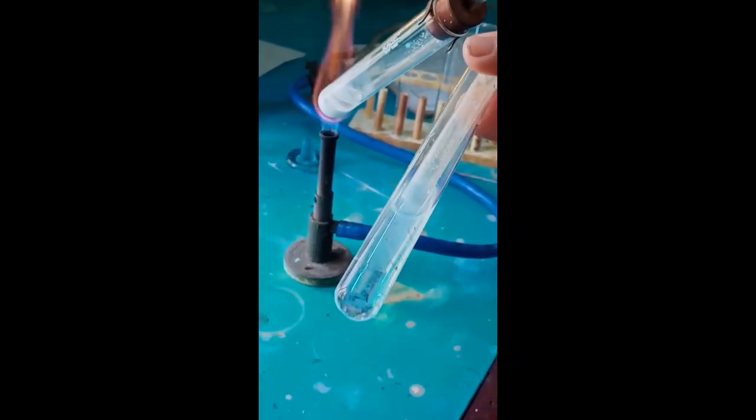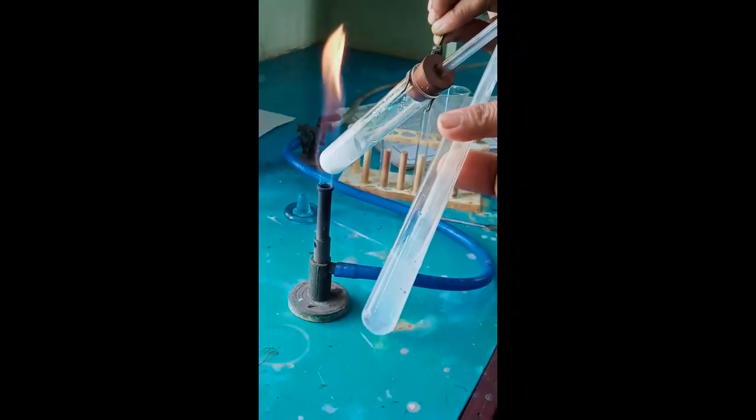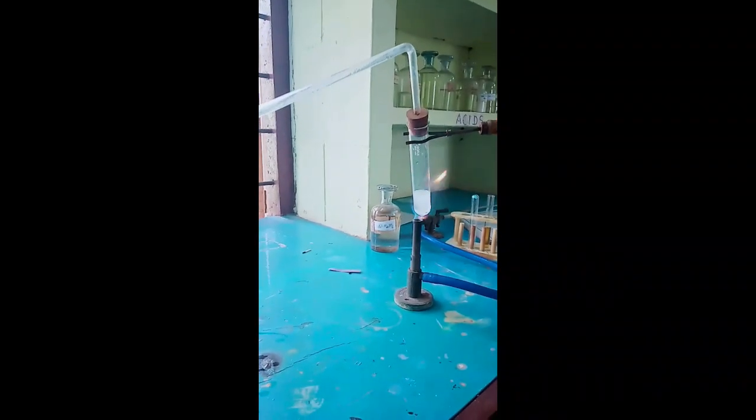So we can say carbon dioxide is a colorless gas which turns lime water milky. And on passing excess carbon dioxide, the milkiness disappears. The next acidic gas is sulfur dioxide.